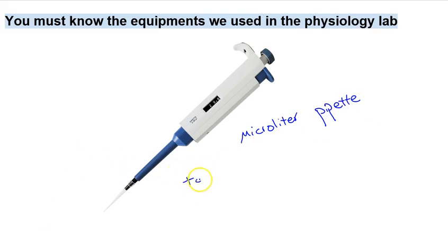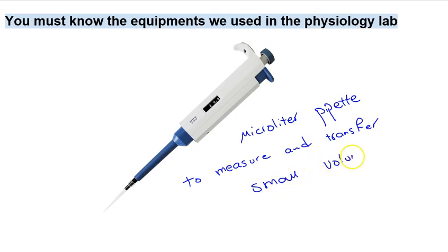To measure and transfer these small volumes of a solution, like 10 microliter, 20 microliter, 100 microliter, 500 microliter, and so on.